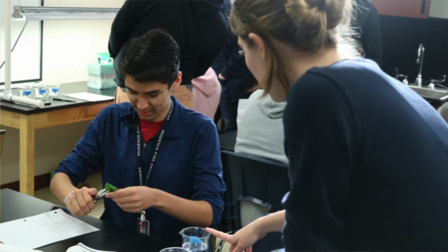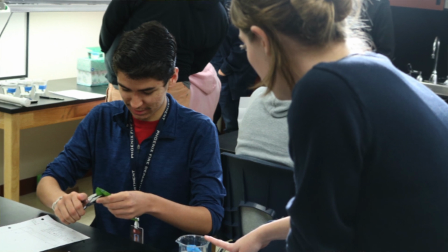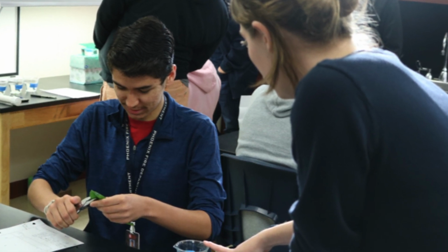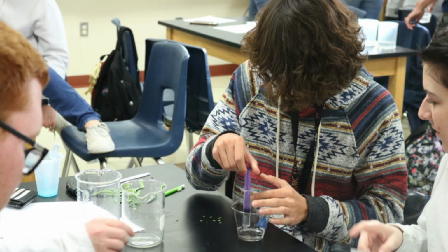And so I wanted to also share with you the details of how the lab is carried out. So first, these students are going to take spinach leaves, and I have them use hole punchers. They punch out little discs from those leaves, and then they place those discs into a solution. And the solution has water in it, of course, but it also has some sodium bicarbonate. They use baking soda as a source for that. And so the baking soda, of course, provides the carbon dioxide.